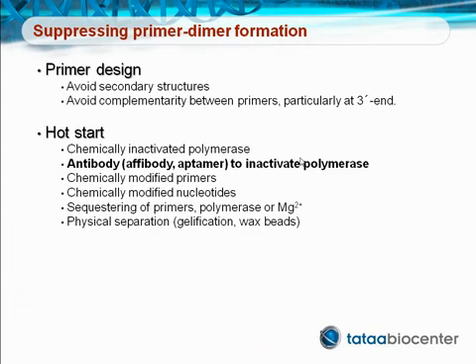Hot start refers to a group of techniques and approaches that maintain the reaction inactive after the mixing of the components until the mix is heated for activation. The most common hot start technology uses heat-sensitive antibodies to inactivate the polymerase. Other options include reversible chemical inactivation of the polymerase, primers or nucleotides, as well as sequestering of critical reaction components or physical separation.